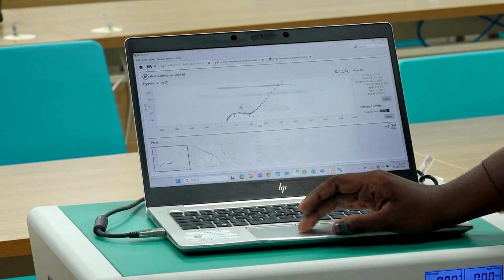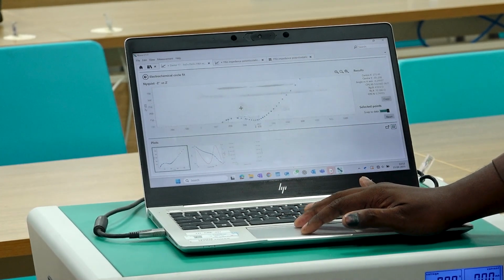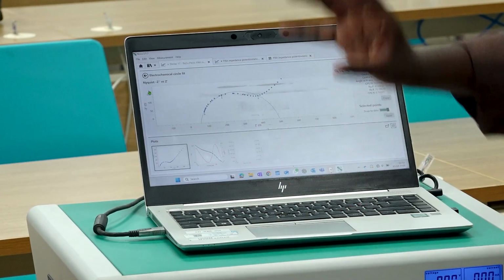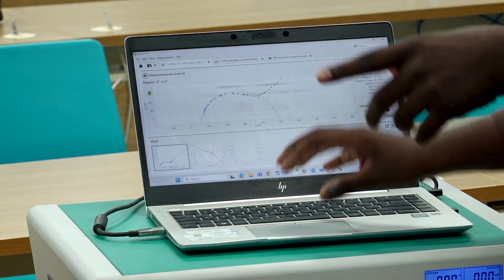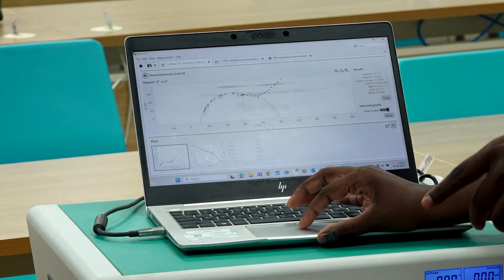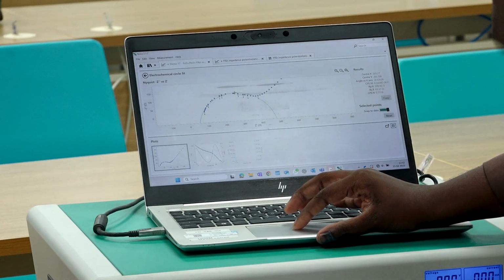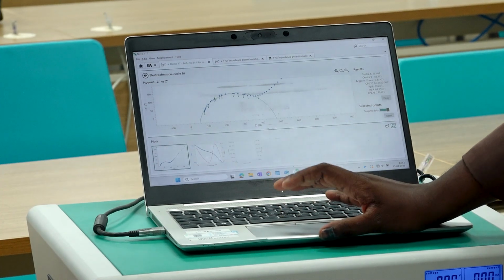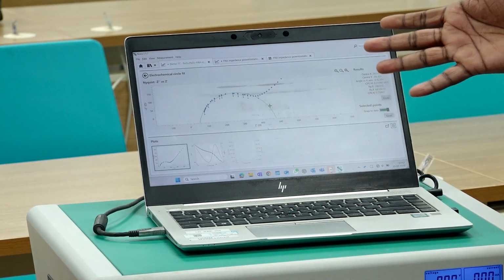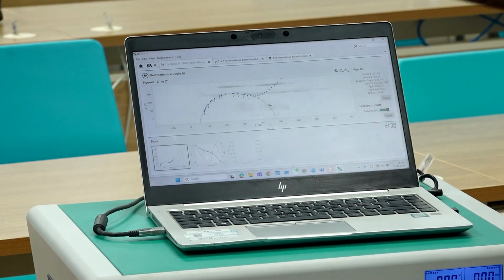Okay. So now you can see some line has been drawn. I told you, for more proper overlapping, you can add many points. You can see that line is shifting, right? Okay, so we can only make a point on the semicircle. If anything is there, that element we have to add in the circuit section only.